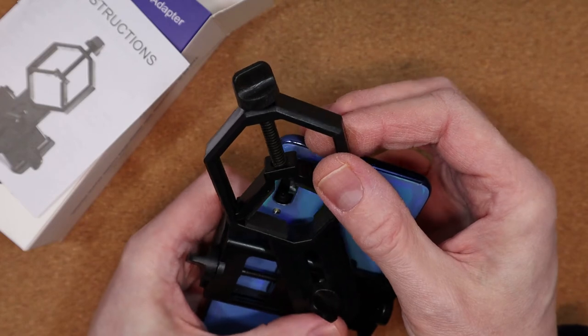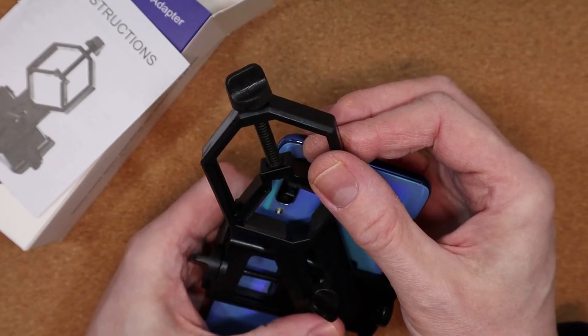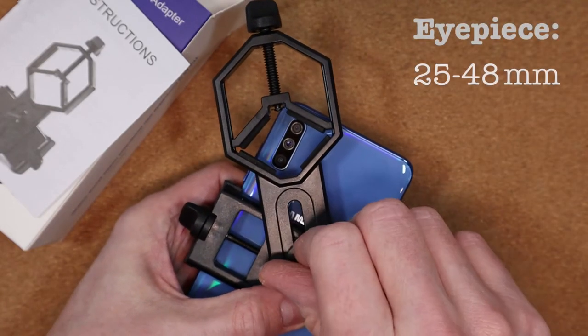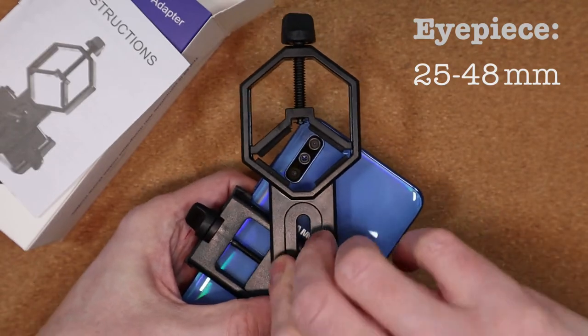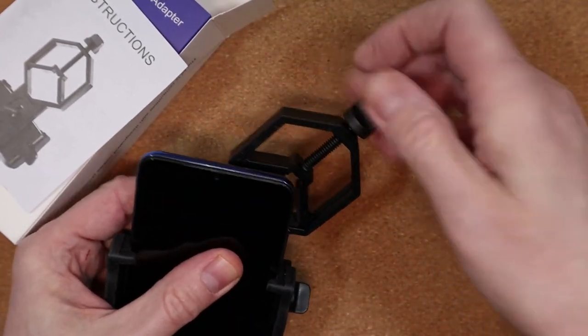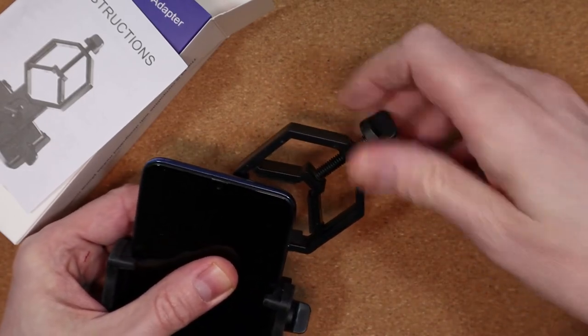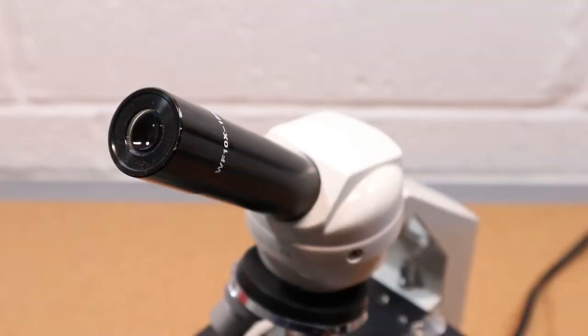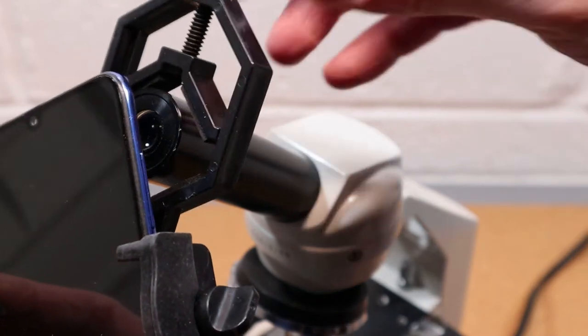Now talking of eyepieces, the instructions state that the adapter will fit any with an outer diameter of between 25 and 48mm. Once you tighten up the second dial, you can open up the eyepiece clamp by turning the third and final dial. It's now time to get the adapter connected to the eyepiece of your device, a microscope in my case.